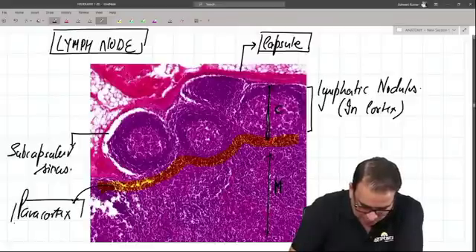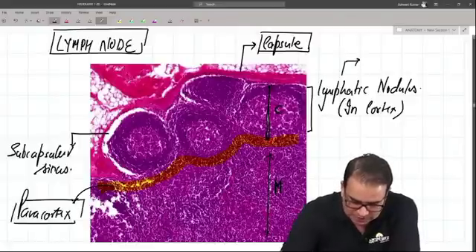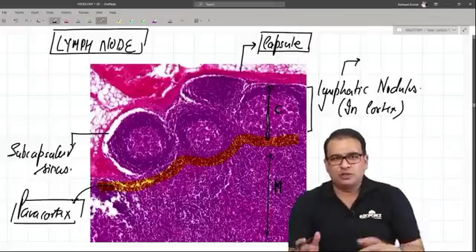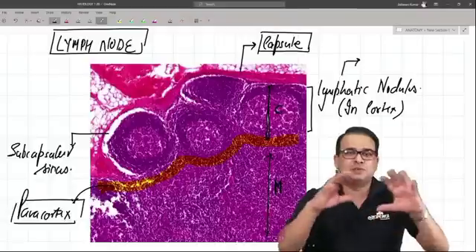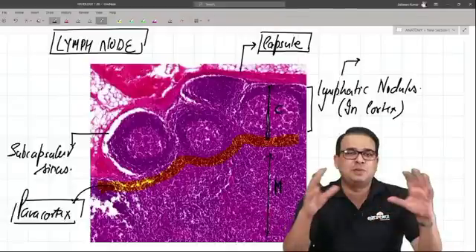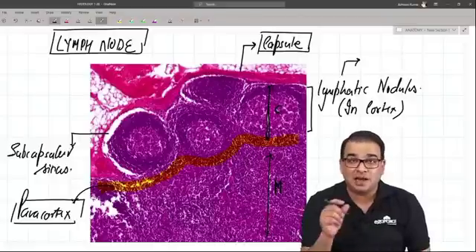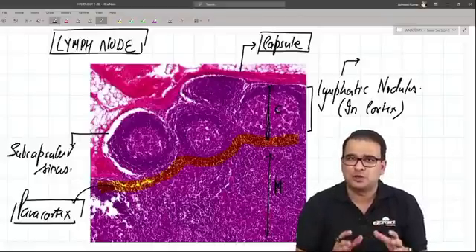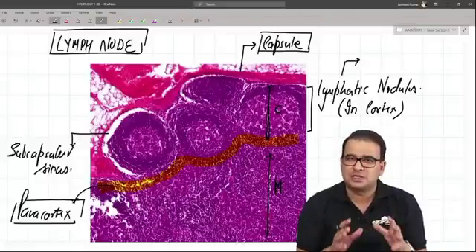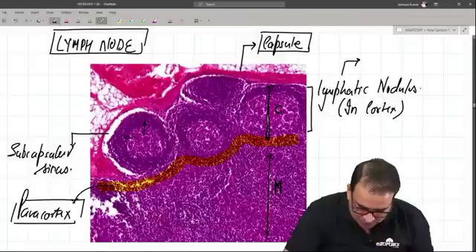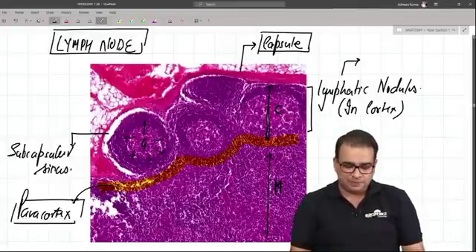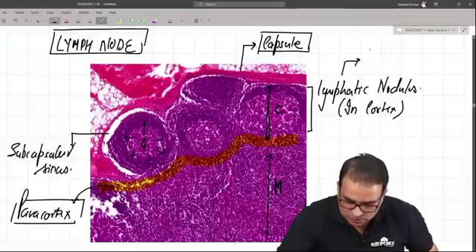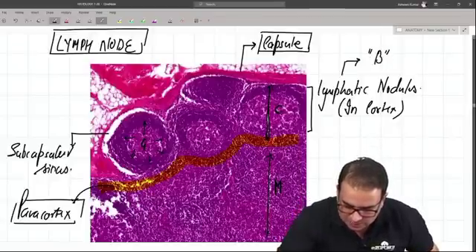In the lymphatic nodule, you can see a germinal center. The germinal center is present, and when cells mature they move toward the periphery, giving us a dense peripheral part and a lightly stained central part with larger but fewer cells. This lightly stained center is called the germinal center in an active follicle. Lymphatic nodules predominantly have B cells in them.